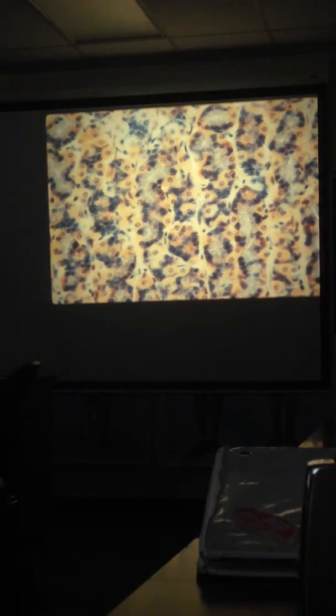See all those reddish cells, orange to red, those are the parietals. Singular one right there, perfect. Let's say, magnify a bit more, looks like a bloodshot eye. And then as you get a little deeper, it starts to go more of a bluish color. So now we descend deeper in the gastric glands, where we're now seeing whole clusters of these blue cells. Those are the chiefs, or zymogenics.